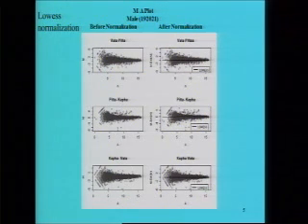What we notice is the points are not symmetrically distributed along the line m equal to 0, if we imagine a line passing through m equal to 0. And there is a sort of non-linearity among the observations if we observe it very minutely. Same picture is for Pitta and Kapha Prakruti and Kapha and Vata Prakruti. So these three graphs before normalization indicate the presence of dye bias.